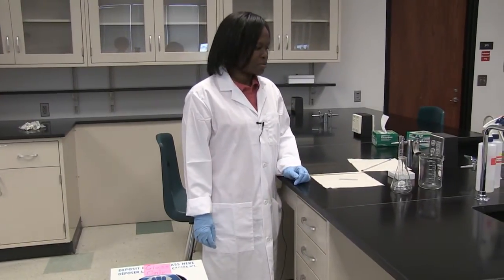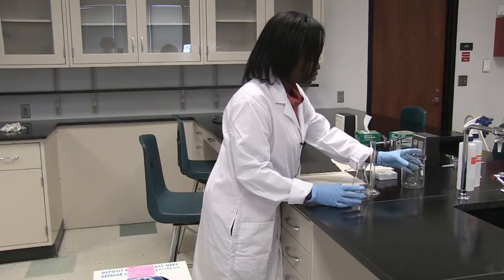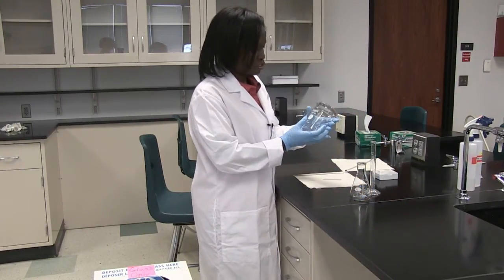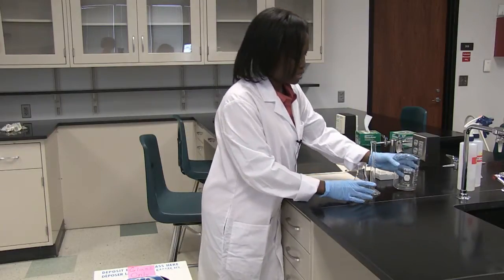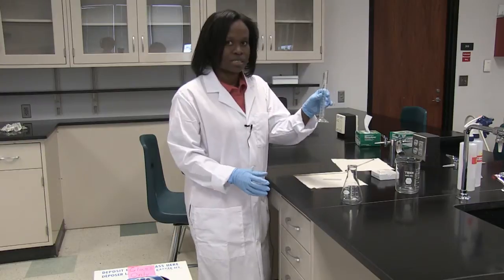So now we're going to learn about how to handle glassware in the lab. These are some of the common glassware that you'll encounter when working in the laboratory. This is a beaker, this is an Erlenmeyer flask, and this is a graduated cylinder.